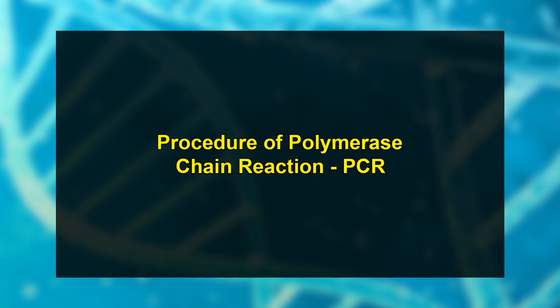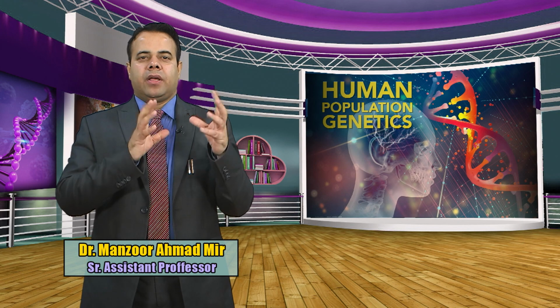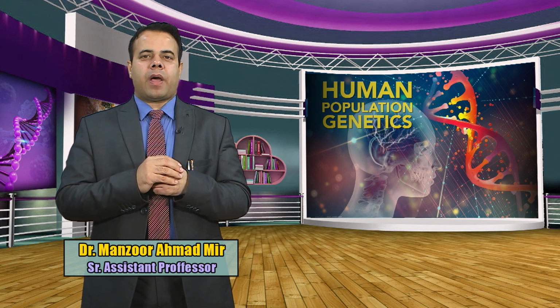Dear students, let's discuss the procedure of PCR. Typically, PCR consists of a series of 20 to 40 repeated temperature changes called thermal cycles, with each cycle commonly consisting of 2 or 3 discrete temperature steps. The cycling is often preceded by a single temperature step at a very high temperature, for example, more than 90 degrees, and followed by one hold at the end for final product extension or brief storage.